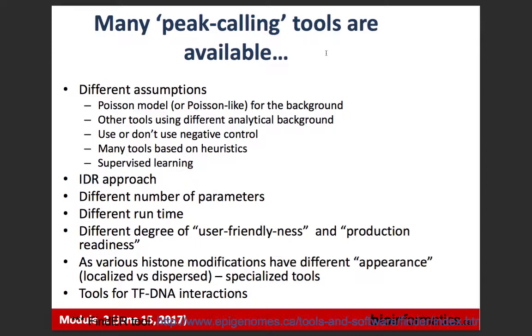If I have time, I would like to introduce to you some approaches which are not using any peak calling and can answer some questions without peak calling. But still, back to peak calling.